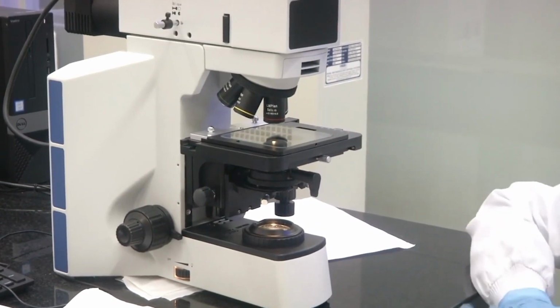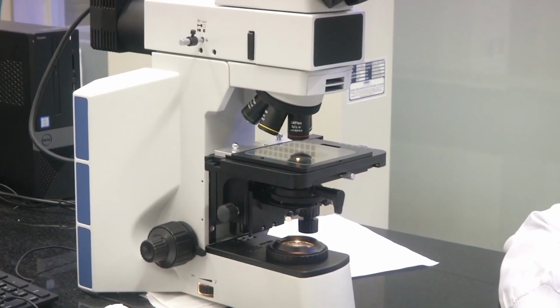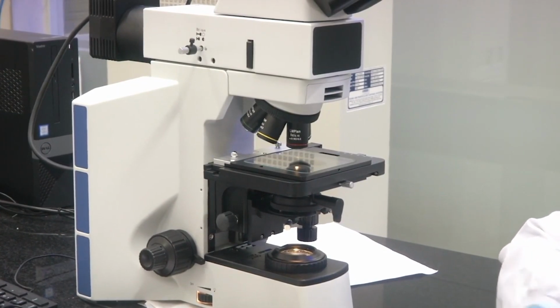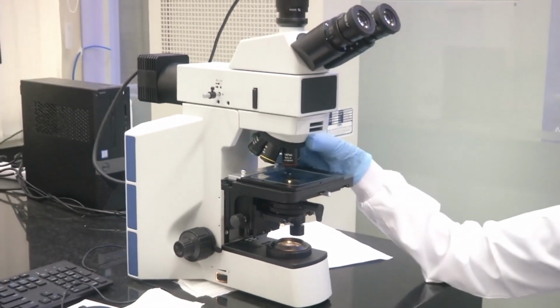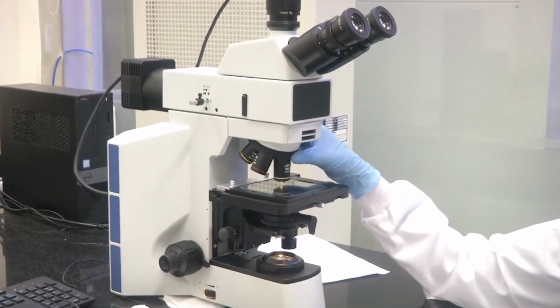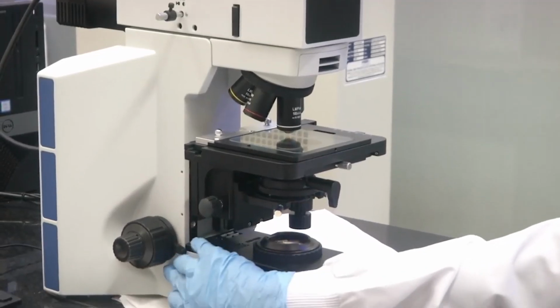Now, let me get back to a few basic concepts about microscopy. The two main optics arrangements for an optical microscope are the objective and the eyepiece. I hope you can see the objective arrangement here. This equipment moves in a circular fashion. Let me switch off the light source for some time.